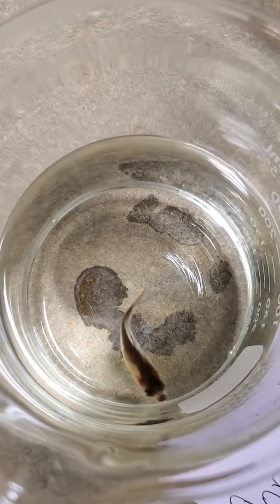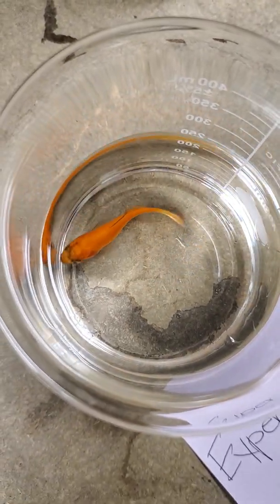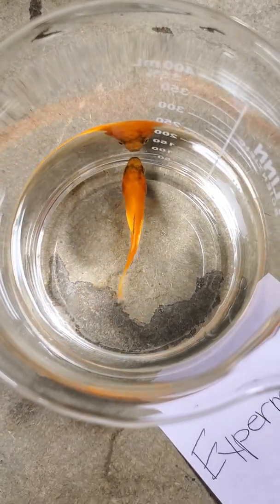And time. Okay, now we're going to come over to our experimental goldfish. Temperature is 14.2 degrees Celsius. And start recording.